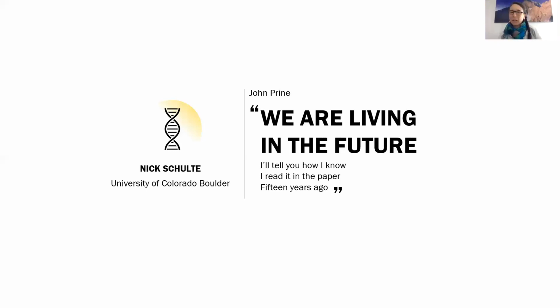Okay, great talk. Do you think a cell-free approach using functional gene abundance rather than species abundance might gain popularity to avoid the need for reference databases? Yeah, I can imagine that being informative and speaks to the power that metagenomics could unlock, or metabarcoding for a functional gene, that we could potentially generate new biotic indices based on functional gene relative abundance.